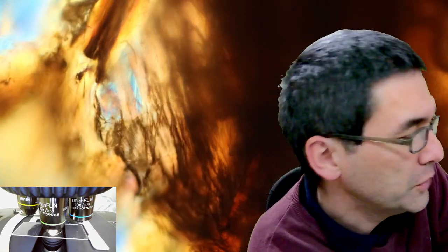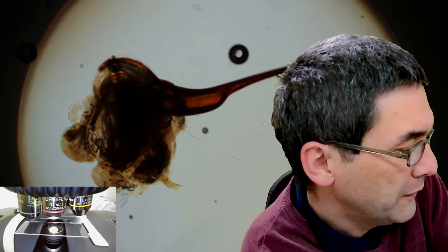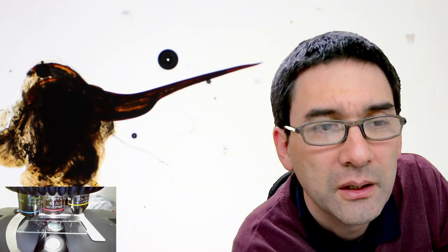And it's way too much, the magnification. So let's go down. In my microscope, if I want to see the whole field of view, I have to remove the condenser, and use this here with the 4 times, and then I'm able to see everything. Okay, seems to be the stinger here.